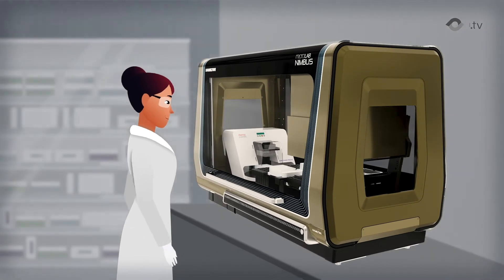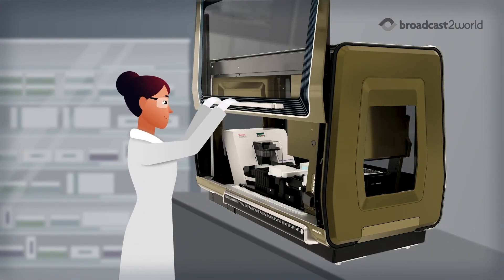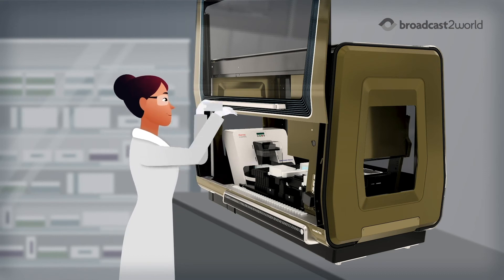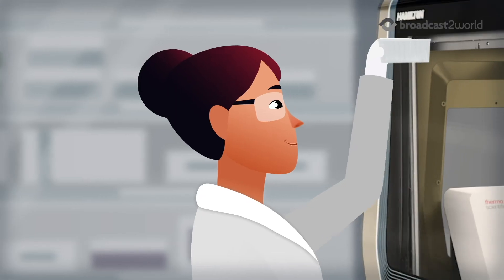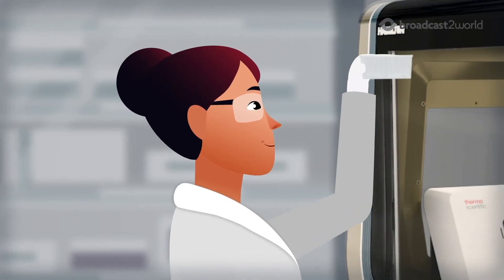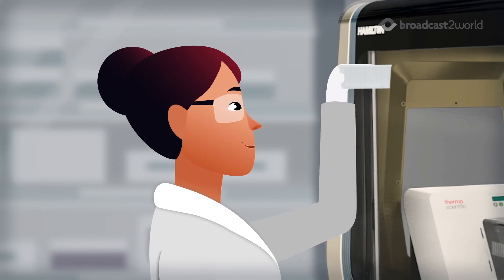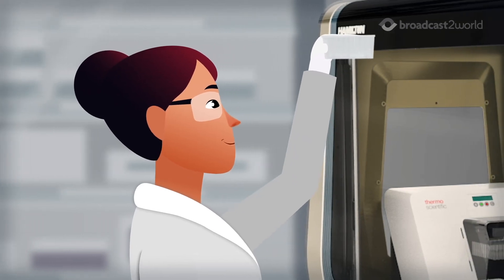By transferring the magnetic beads instead of the liquid, inhibitors are left behind, resulting in extracted DNA of high quality. The pre-configured deck and pre-validated Prep Filer script make implementation quick and painless.